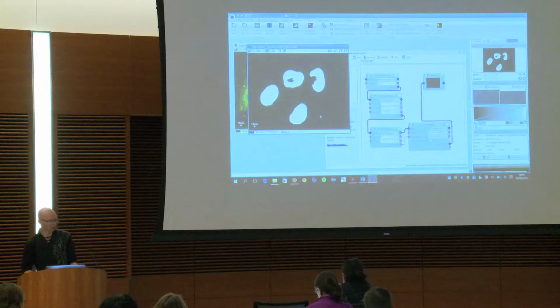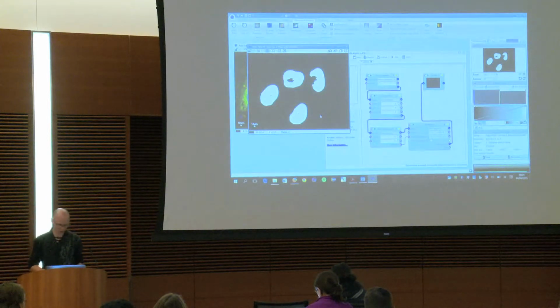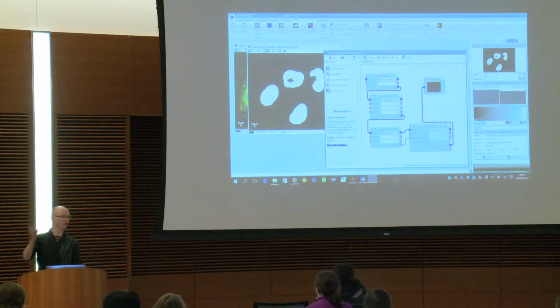So we are happy, but still we are not yet able to quantify really the nuclei. We have just the image. So what we can do is try to use the ROI instead. So the region of interest. So for this, what we want to do is to display the region of interest over the original image.